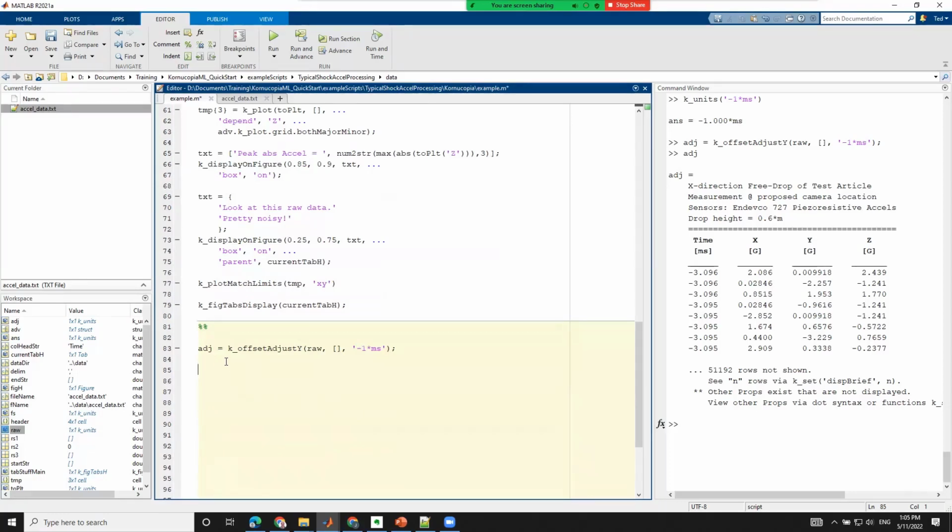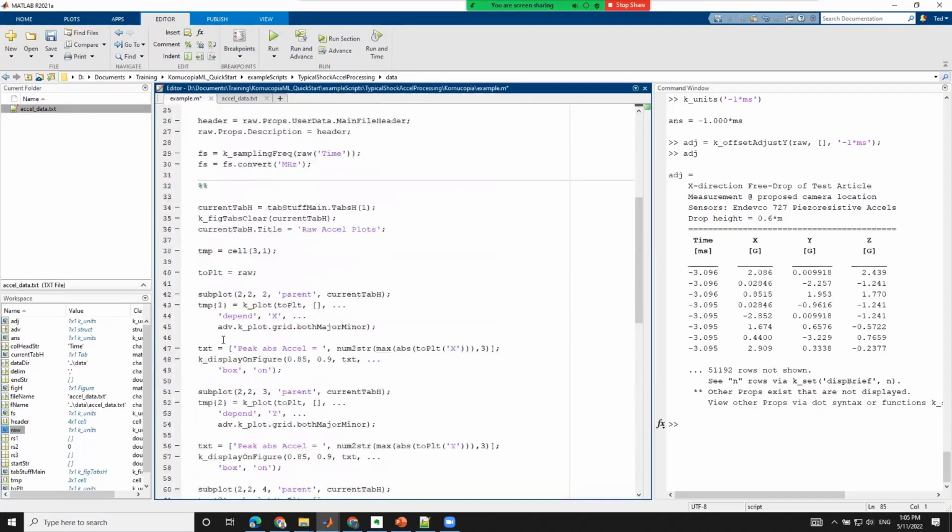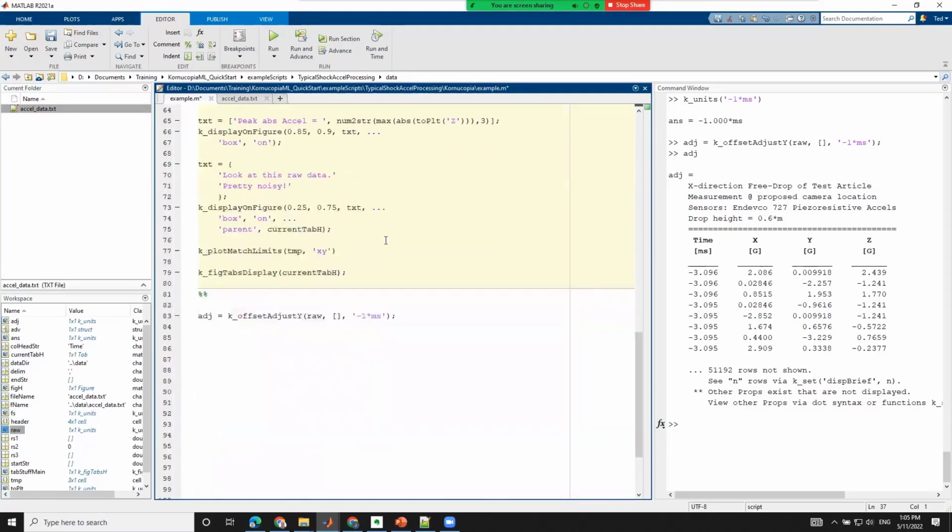So before we make the plot, we're gonna just go up here and steal this, copy that, because that's gonna tell us we want to be in plot number 2. And this is going to be adjusted data, or whatever name you would like to call it. And we will steal the bottom couple things because we're going to have it still make all the plots look the same, and we're going to have it display the plot.